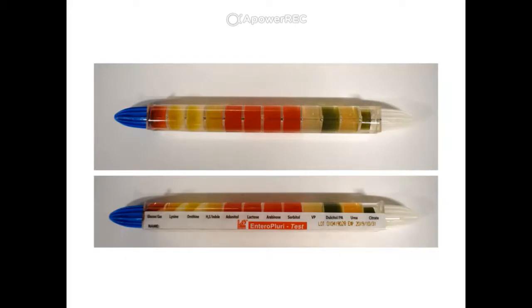This brings us to the Enteropluri test. This is a tube that allows scientists to rapidly test a variety of tests in one single inoculation. So this tube has a variety of different mediums stored along this tube, and one can inoculate with a needle each one of these mediums and examine the results in order to determine what bacterium it might be growing. This is good again for enterics only.